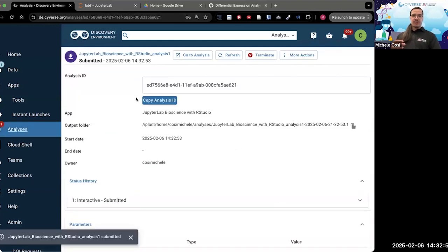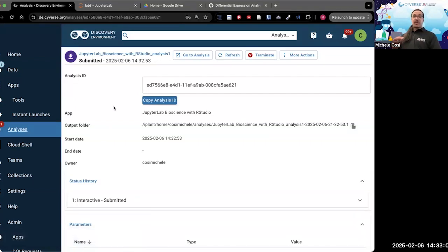This shouldn't take too long. You can see that now my analysis has been submitted, and soon it will start running.